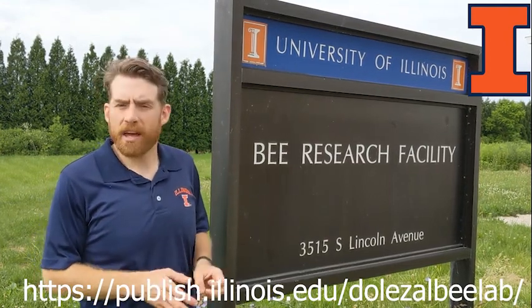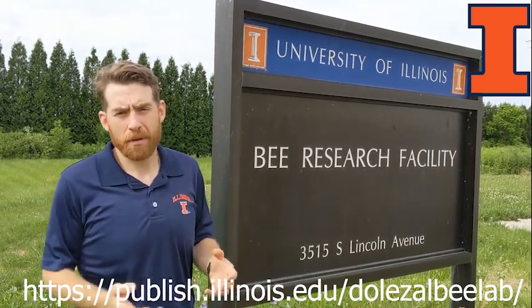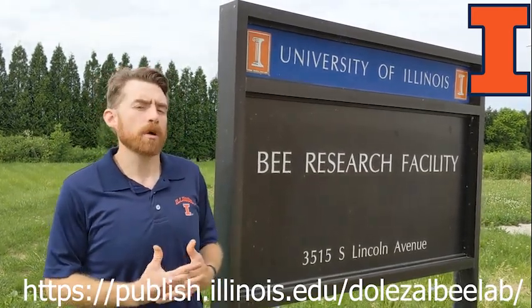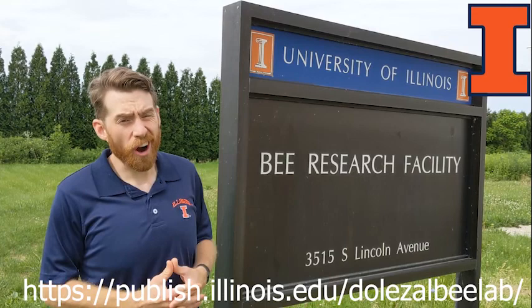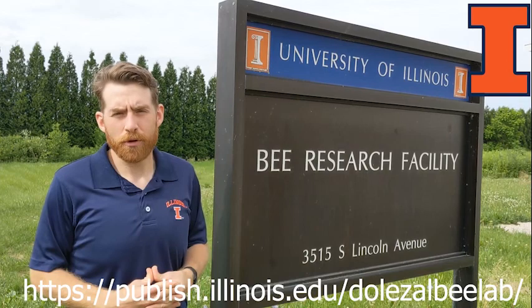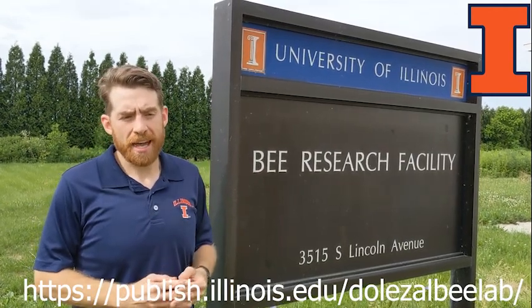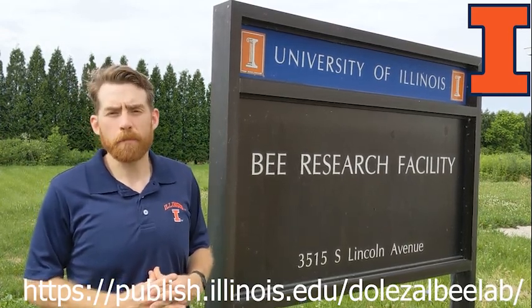When you see news headlines or you read summaries in magazines like American Bee Journal and Bee Culture, you often see descriptions of scientific experiments that are done, but it's not always clear how those were set up and how they're performed. And so I thought this would be a nice chance to show off some of those things that are really hard to show off in a real physical tour because we can't let a lot of people into those incubator rooms or into some of our lab spaces. And so this video lets us show those things and kind of make the most of some of the challenges that we're facing in having these types of presentations right now.